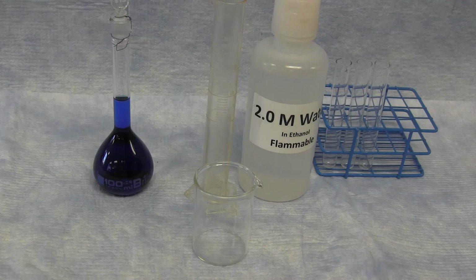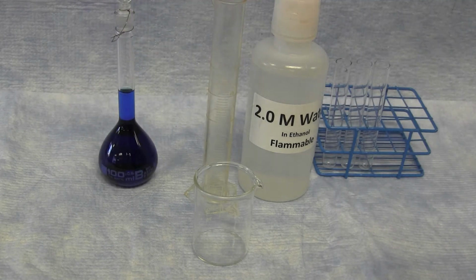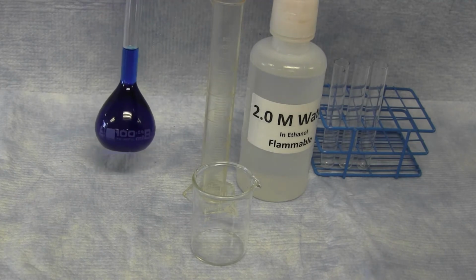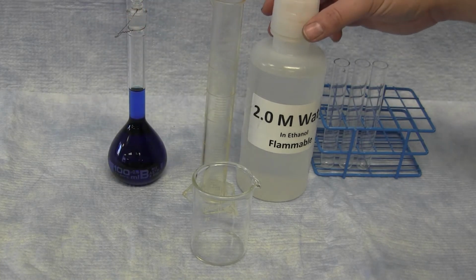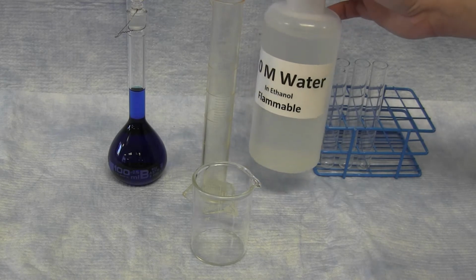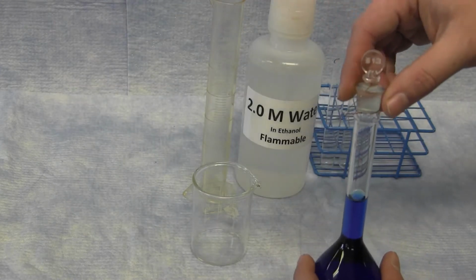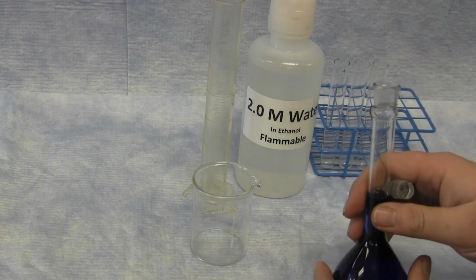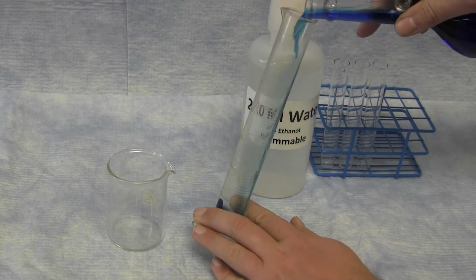Once the cobalt chloride solid is dissolved in the ethanol, you will be combining this solution with a known amount of water. You will be preparing 50 milliliters of a combined solution in a 50-50 split. You will measure out 25 milliliters of cobalt chloride tincture in ethanol and 25 milliliters of a 2 molar water solution in ethanol. In this experiment, ethanol is the solvent and water is one of the reactants and is involved in the equilibrium.